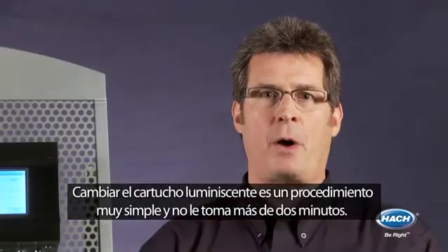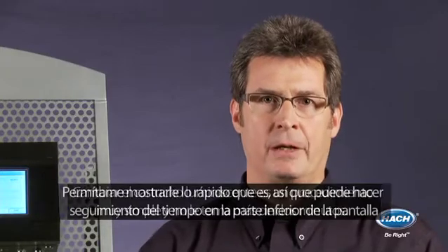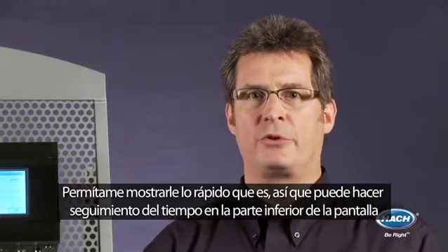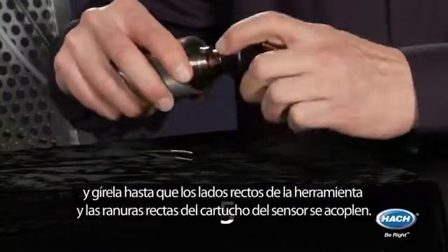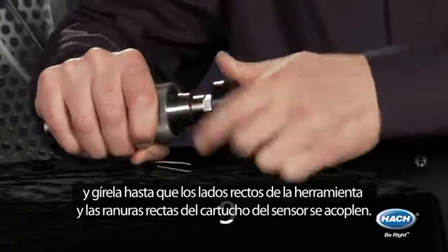Changing the luminescent spot is a very simple procedure and takes less than two minutes to complete. Let me show you just how fast it is — you can keep track of my time on the bottom of the screen. Push the maintenance tool as far down as possible over the old sensor spot and twist until the square side of the tool and the square slot of the sensor spot engage.